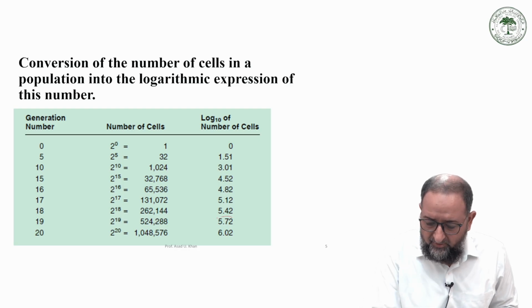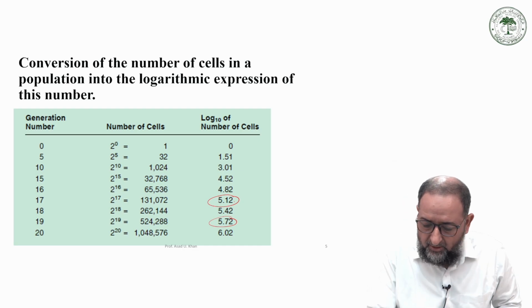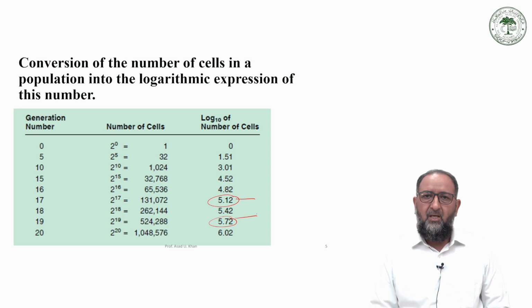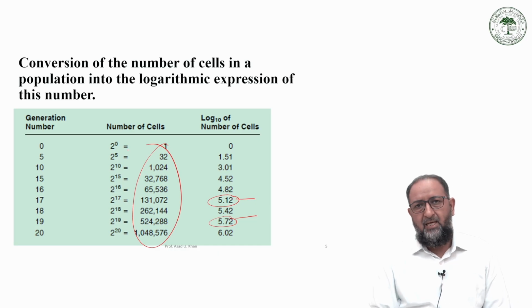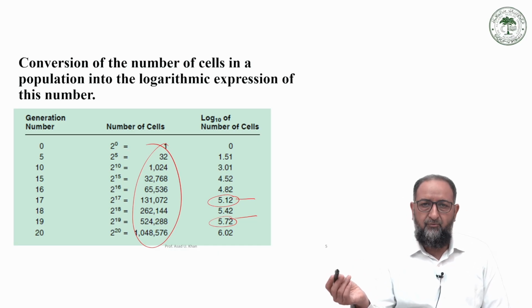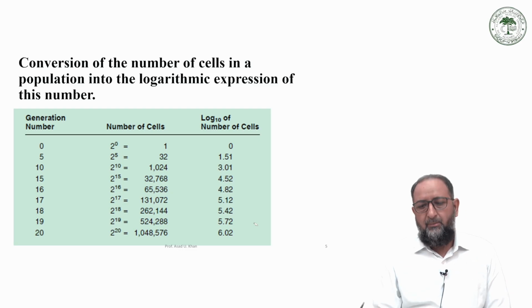These values are important for calculating the number of cells present. When you calculate the log 10 value of the number of cells, that will reflect the total number of cells present, and this will help you on the clinical side, for example, the number of cells present in an infection. For example, if you are working on an infection control model and you simply calculate the CFU.